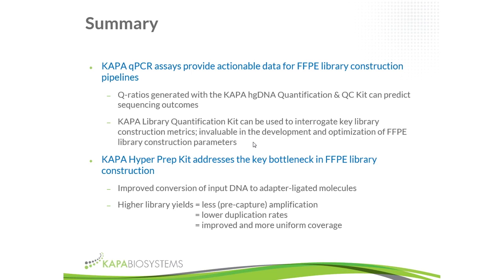because if your pipeline is very well optimized from the beginning, it's going to be robust and it's going to have a lot of tolerance for samples of different quality. If it's very close to breaking point, like right on the edge from the beginning, it's going to break really quickly. And then you just end up having to troubleshoot and come back. So when we help people develop and set up pipelines, looking at those metrics up front is really, really invaluable.